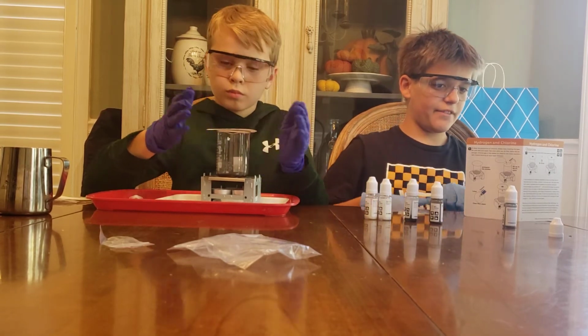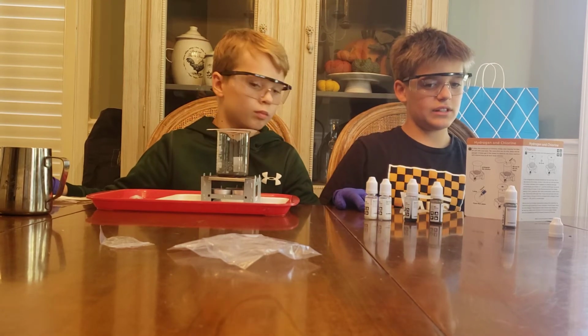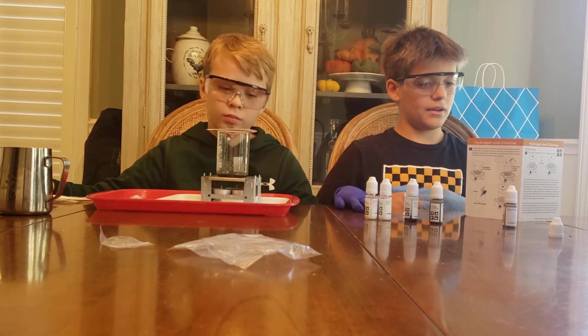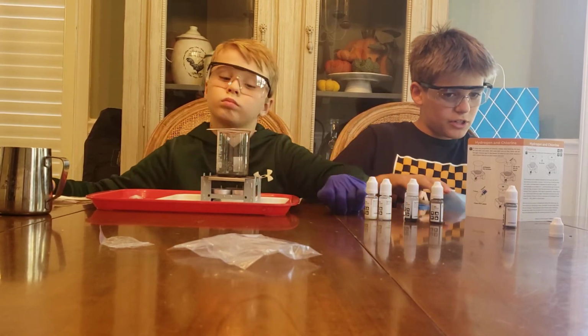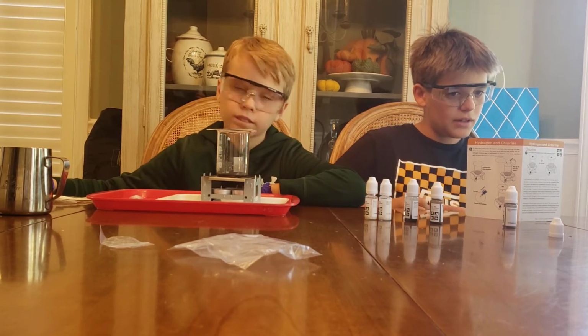Step 5. The reaction begins when you light the candles. You can determine the presence of chlorine by observing the color changes in the KI spot on the filter paper.